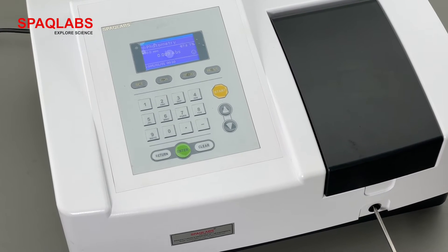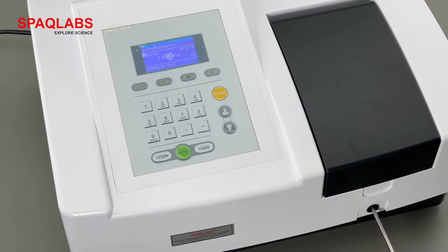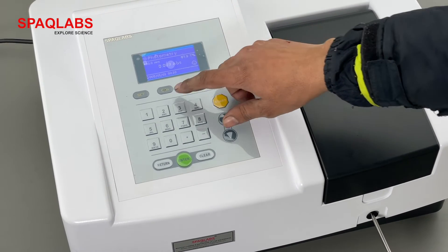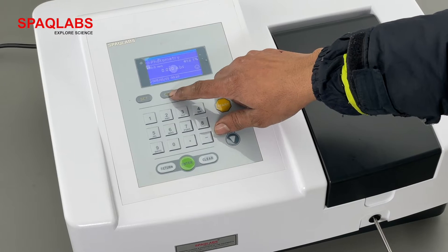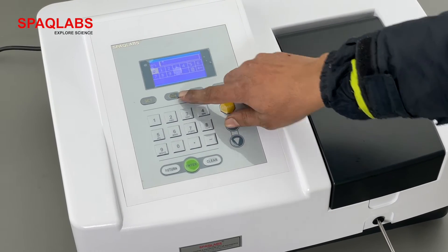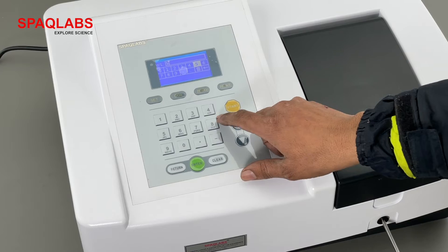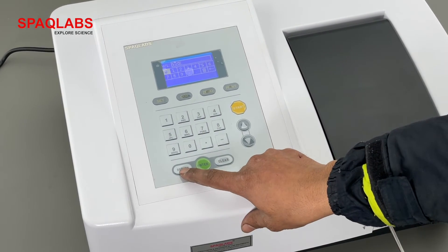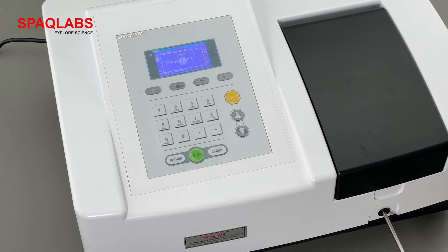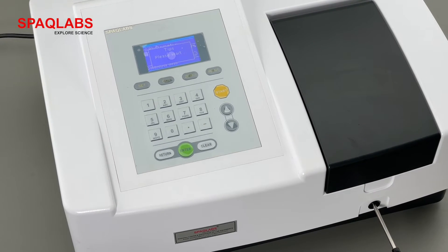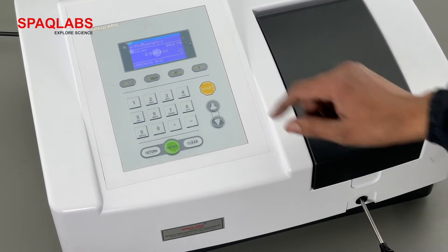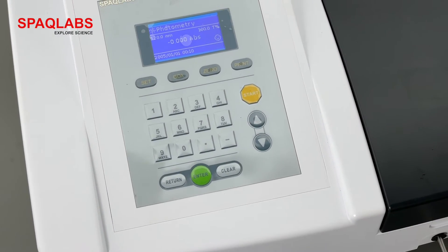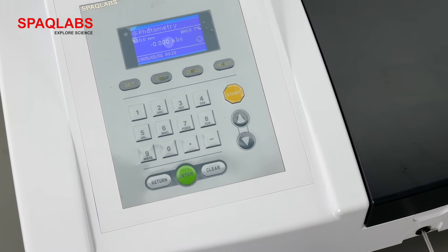Now we need to select the desired wavelength at which we want to check the sample. Press 'Go to wavelength' and enter 520, then press return. The wavelength will be automatically adjusted and on the display you can see 520 nanometers. Right now the ABS value is showing.